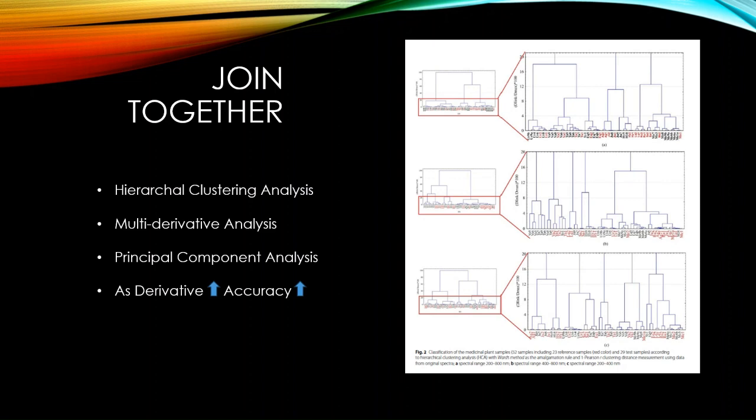PCA analysis combined with Varimax rotation evaluated the first, second, third, and fourth order derivatives of the original spectra, maximizing the variance of each principal component.